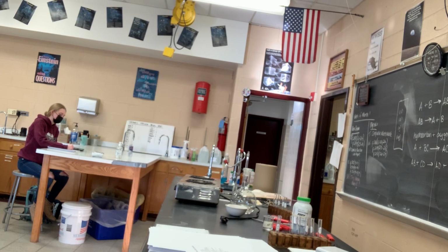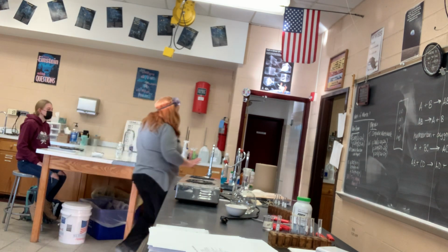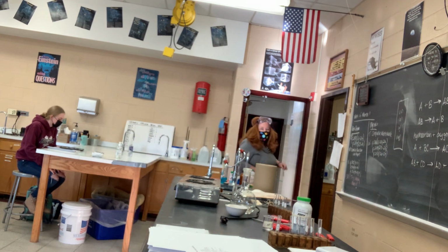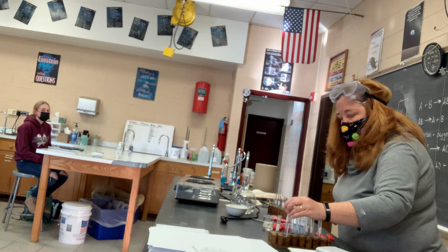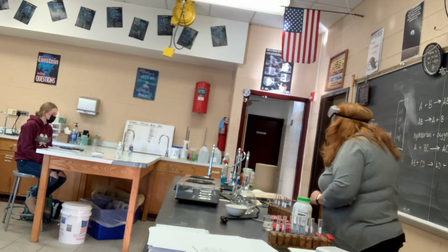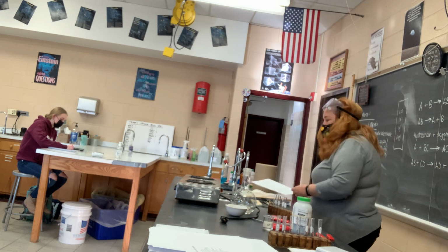It was hotter, but it's not as hot right now. Cooling down, it's going back to room temperature. So that's a single replacement. Put that here. And then the next single replacement, this one's not as exciting.